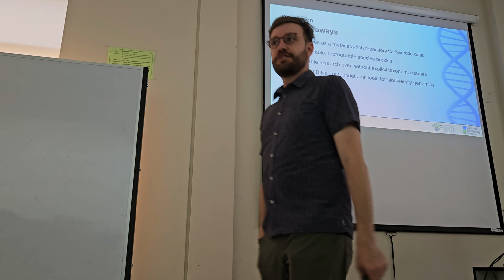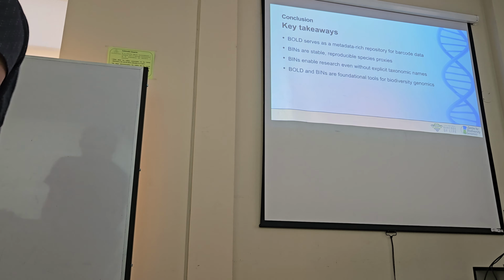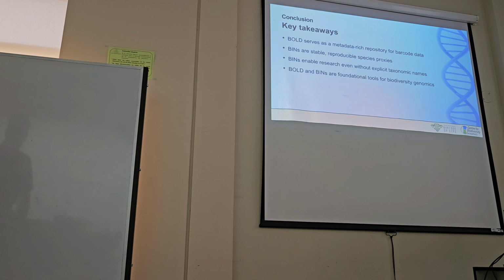Any other questions about BOLD? Yeah, sure. About that, what is the similarity threshold typically used to make a valid match? The question is, what is the percent similarity of a sequence to an existing record that is used to make a valid match?